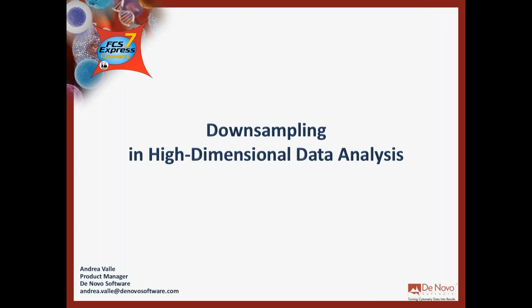I saw an example of a data set in which the normalization was really useful and removed the batch effect and was able to improve the results, but some other times it simply didn't do a good job, so it was not worth doing that. Downsampling is something that is frequently used.